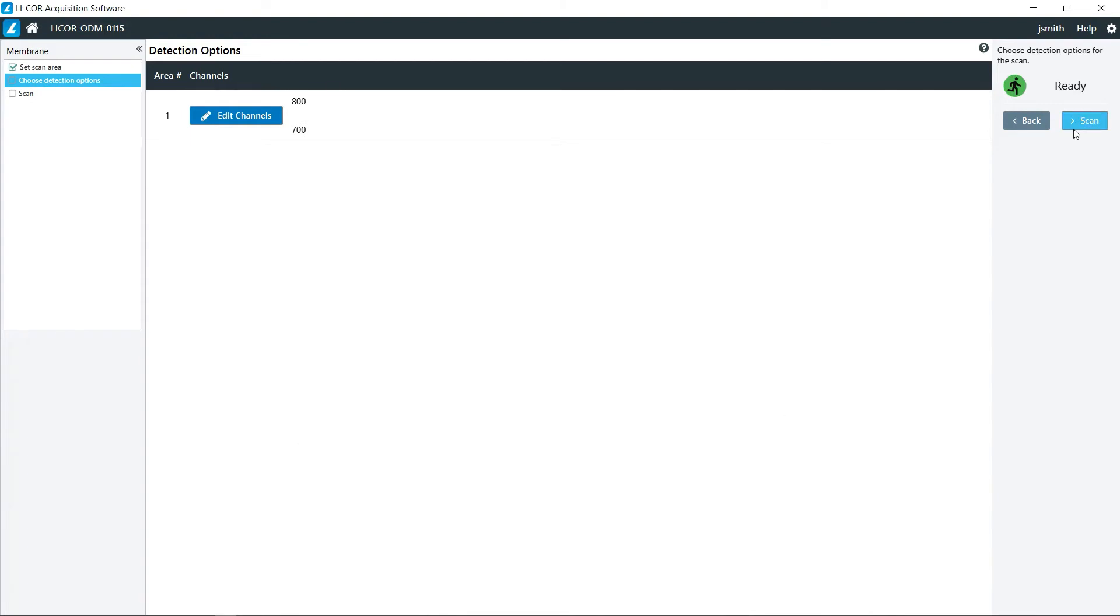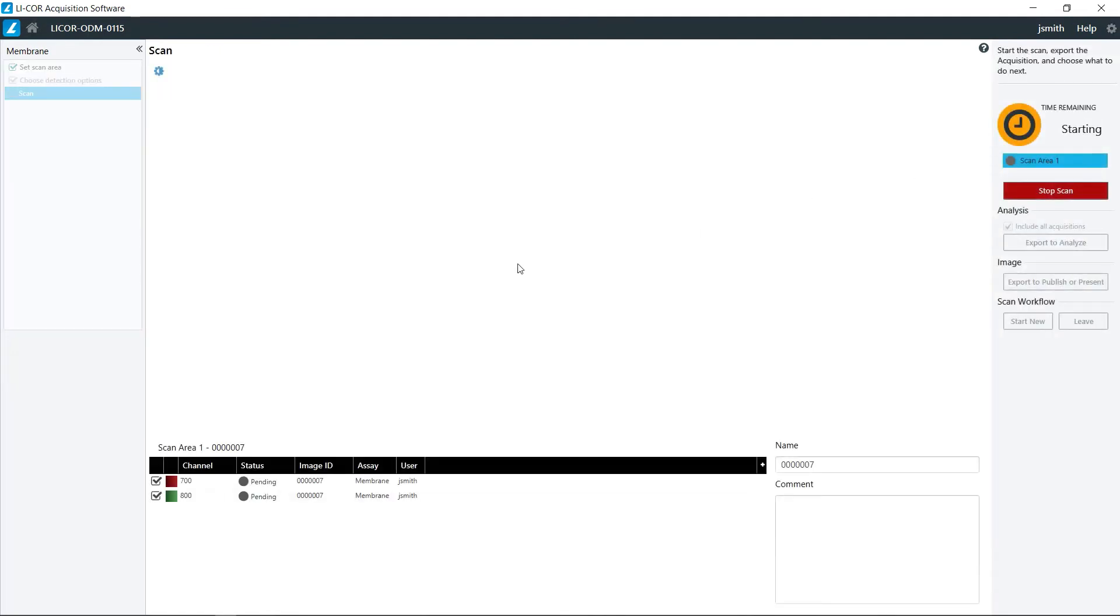Once you have selected your wavelengths, go ahead and click on scan. Now if you do need more options as far as resolution or things like that, you will have to do a custom scan which I will be showing in a different video.